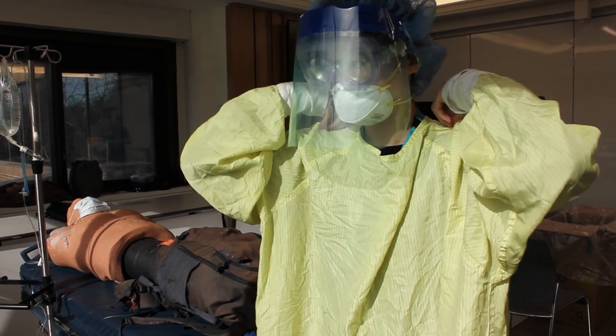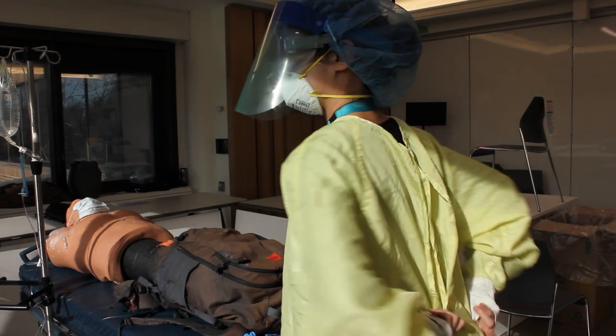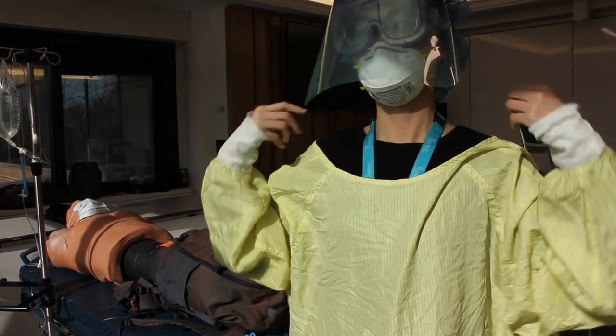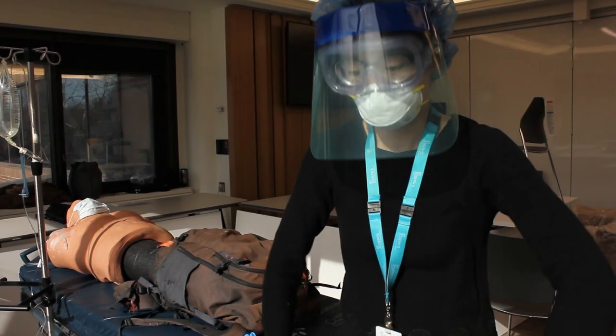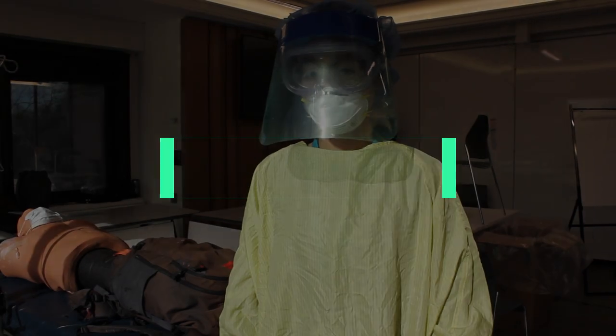Nancy, do it the right way now. You don't have to retie the gown — show that good posture. When you're taking off your gown, your chin is up, you're looking at the sky. Keep your face off your PPE. You can roll it right off. Removing your gown properly.